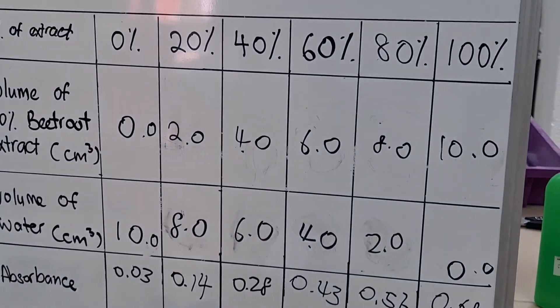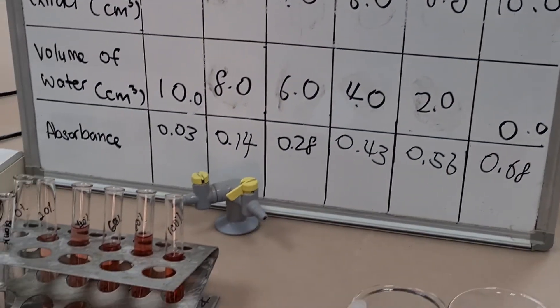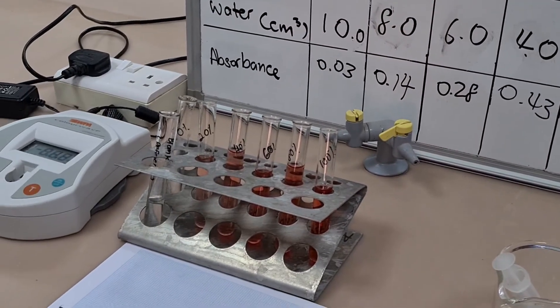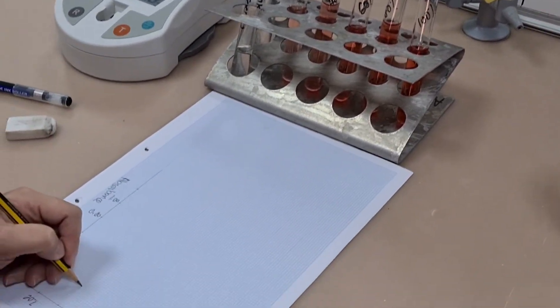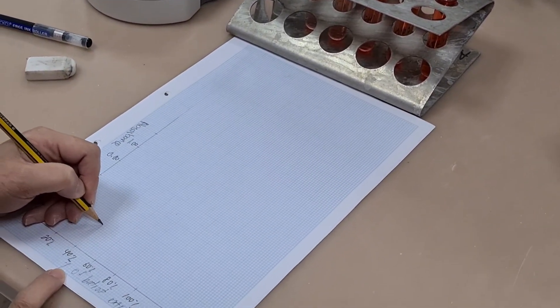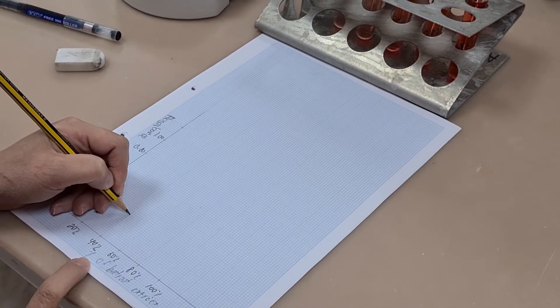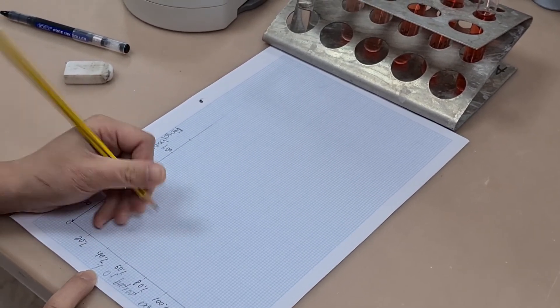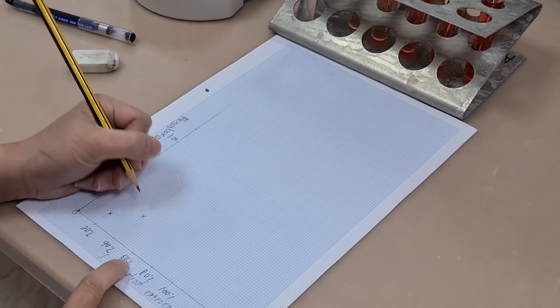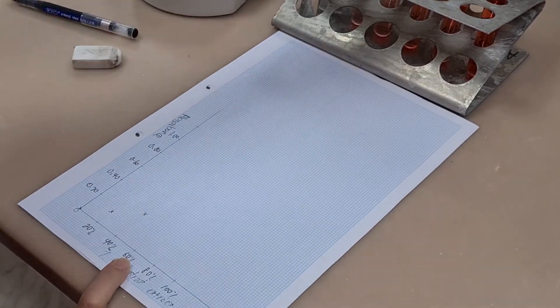The second mistake that's been made is that while there's been a zero added at the intersection of the x-axis and the y-axis, there should be two zeros on there to show that the x-axis is at zero and the y-axis is also at zero.